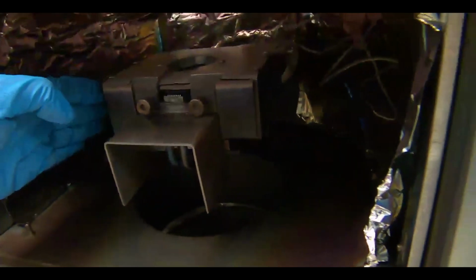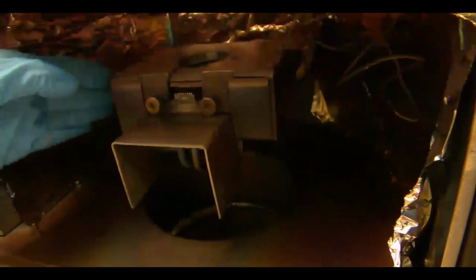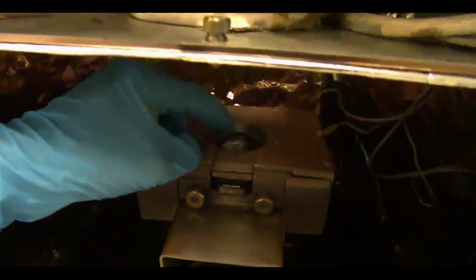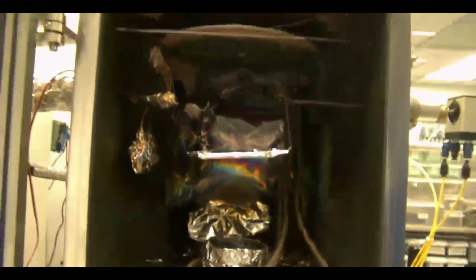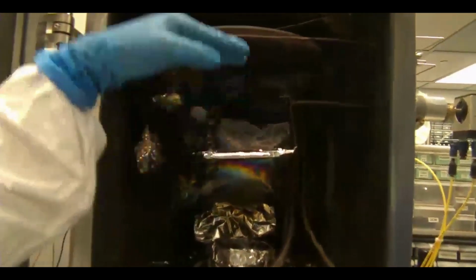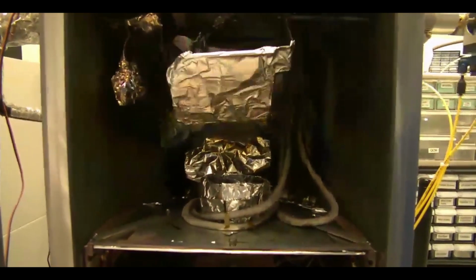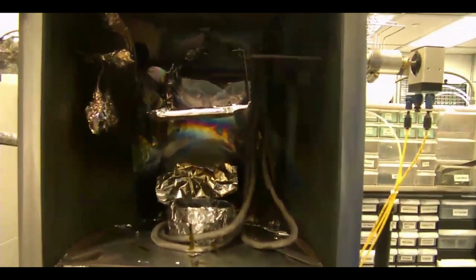And then there are magnets here on both sides that create a magnetic field that goes left to right or right to left. And that'll bend the electron beam and put it inside this pocket. This is where the crucible is. And then this substrate sits up here, upside down. There's a shutter. The shutter just opens and closes to start the deposition.